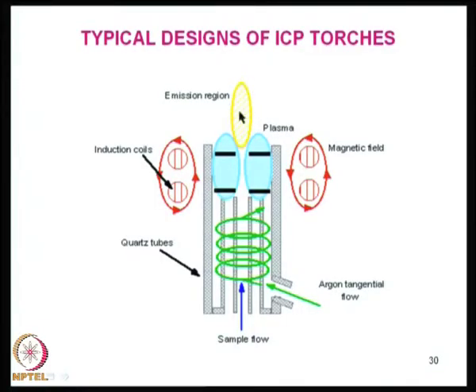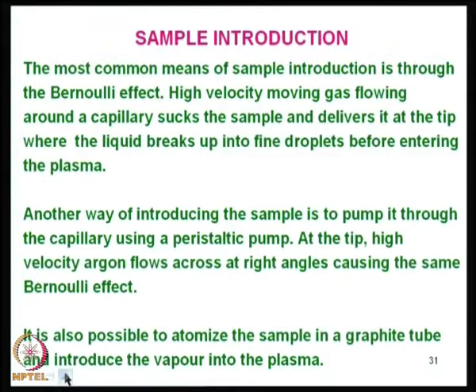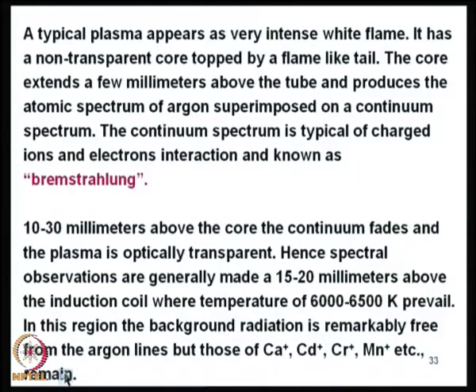This appears as a very intense white flame, and quite often you may not even see the flame if the plasma is having very high temperature.